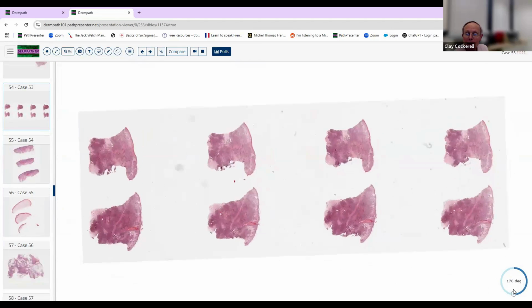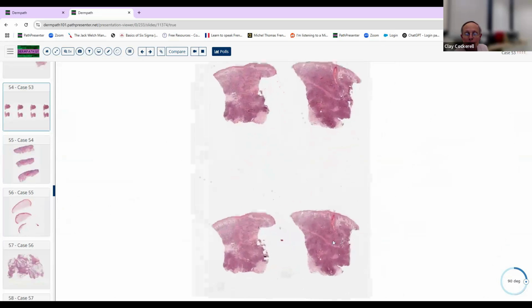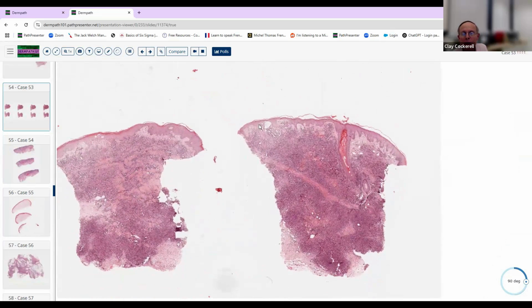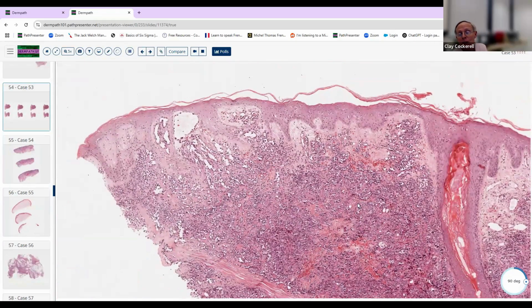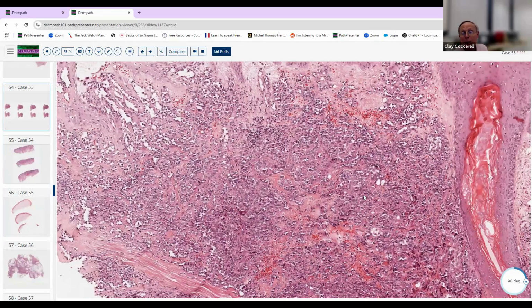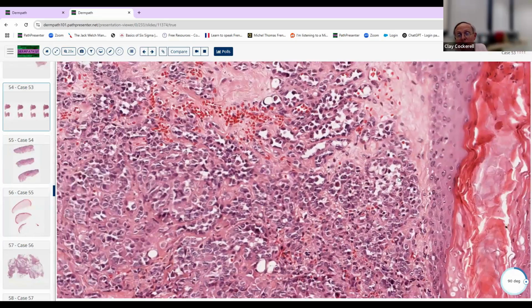That's a diffuse inflammatory infiltrate here. All right, so very, very diffuse infiltrate here. Something's going on here that's very diffuse. Is it inflammatory or neoplastic? We're not really sure initially. We start looking at higher magnification, and no, it's not inflammatory. It's got all of these spaces here, and these are neoplastic cells. At low magnification maybe they could be histiocytes, but with the higher magnification, these are neoplastic cells.